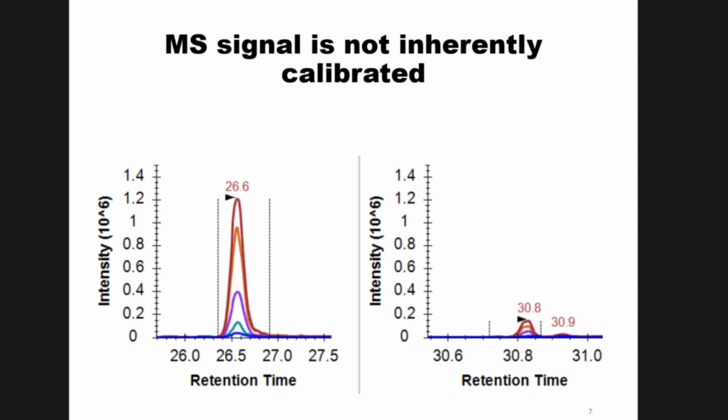So Andy gave us good motivation this morning, but I want to motivate you a different way. If all I told you was the chromatogram on the left and the chromatogram on the right are the same peptide in two different samples, could we say this sample has more abundant peptide than the other? Certainly the peak area is more intense. We have a higher peak area in this sample on the left, and a smaller peak area in the sample on the right.